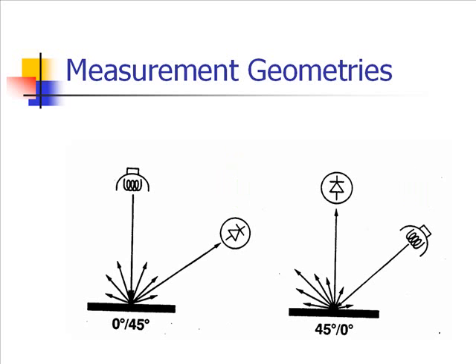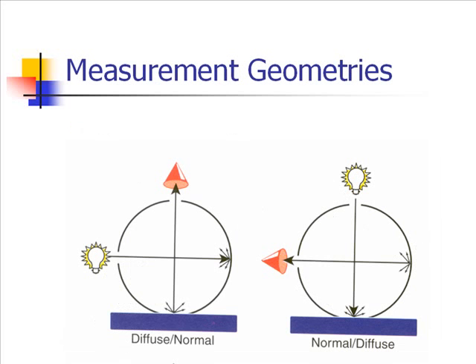And the difference here is we have a sphere, this isn't just a circle, but a sphere called an integrating sphere, that when the light shines into the sphere, it bounces off our sample, and then the light from the sample bounces off the integrating sphere, so that all the light that comes off of the sample is collected. It's not only the light in a certain angle. So no matter what angle the light is diffused off of the sample, it's collected by the detector.